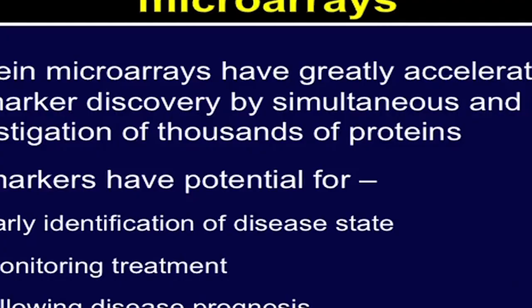various drug treatments. As you know, there is need for early detection of disease and therapy for diseases such as cancer. However, the discovery of specific and sensitive markers remains challenging. Researchers have employed different types of technologies, including protein microarray based systems, to identify biomarkers which could be used for early disease detection, as well as accurate detection which could be employed in many applications.